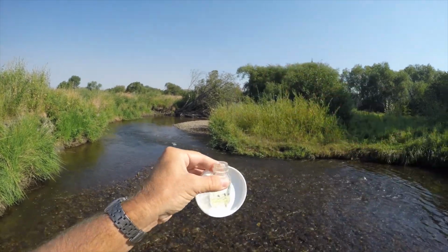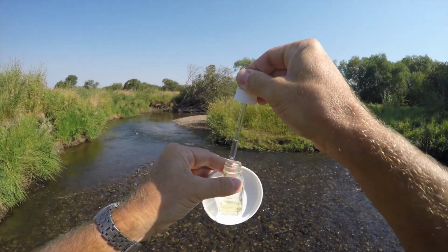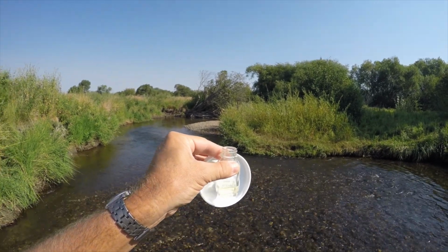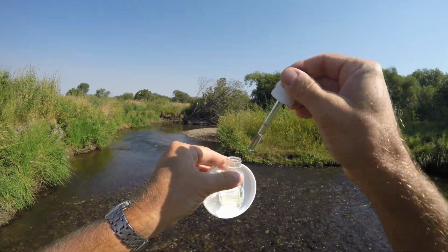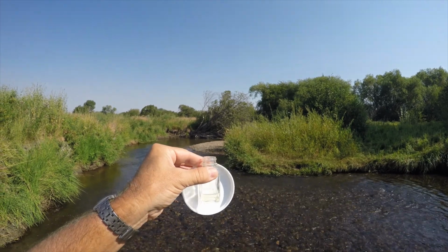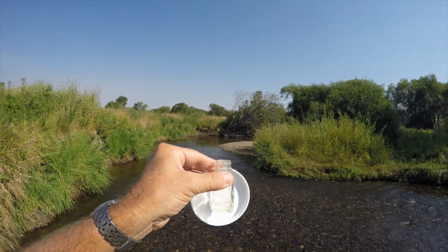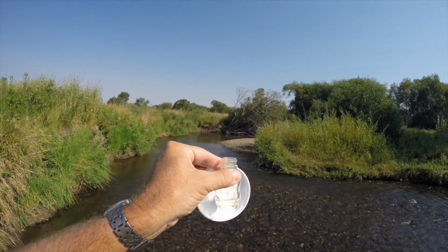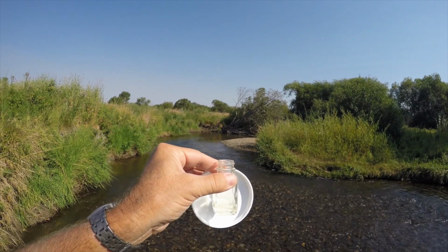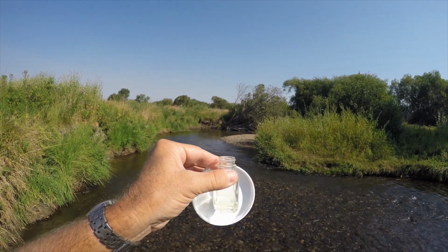Seven. Still yellow. 8. Ooh, getting very close. Just a hint of color. 9. I don't know if you can see that on the camera, but it is very, very clear. But there might be just a tiny, tiny hint of color. So we're going to add one more drop to see if it changes. If it does, the drop counts. If it does not, we'll stay at 9.